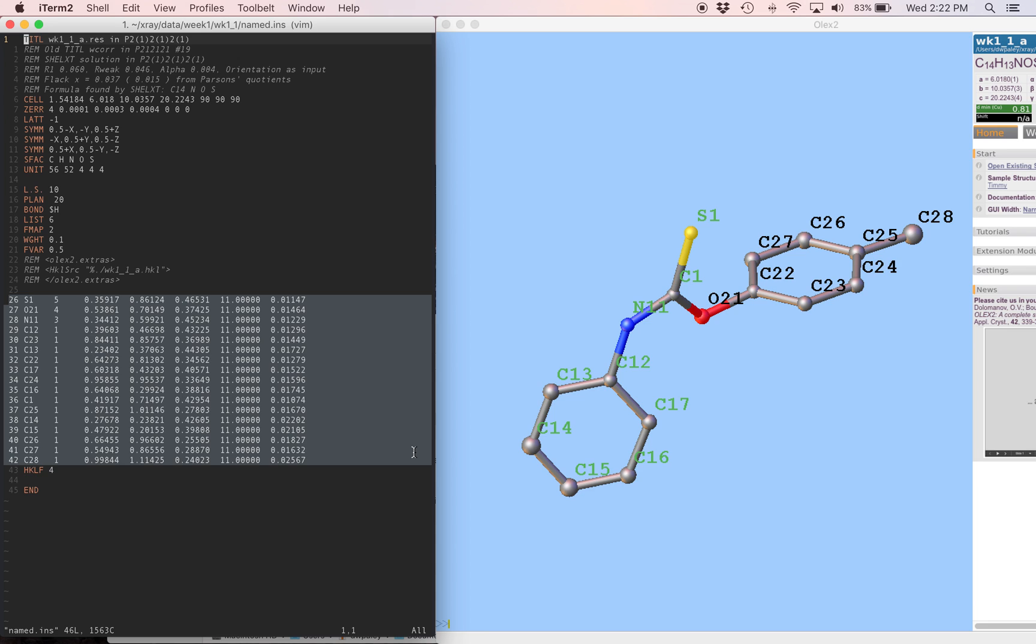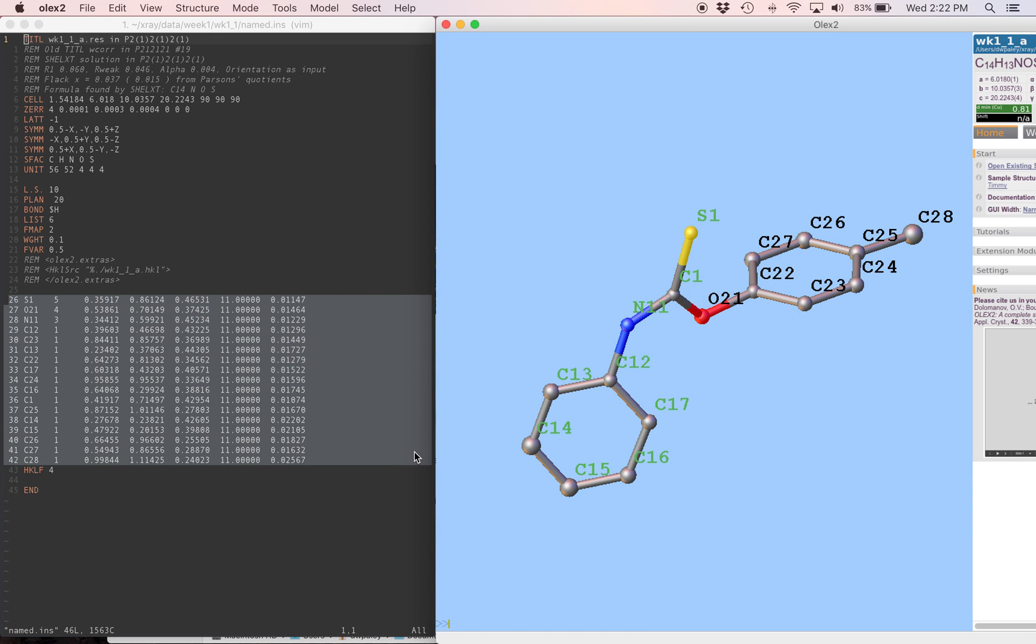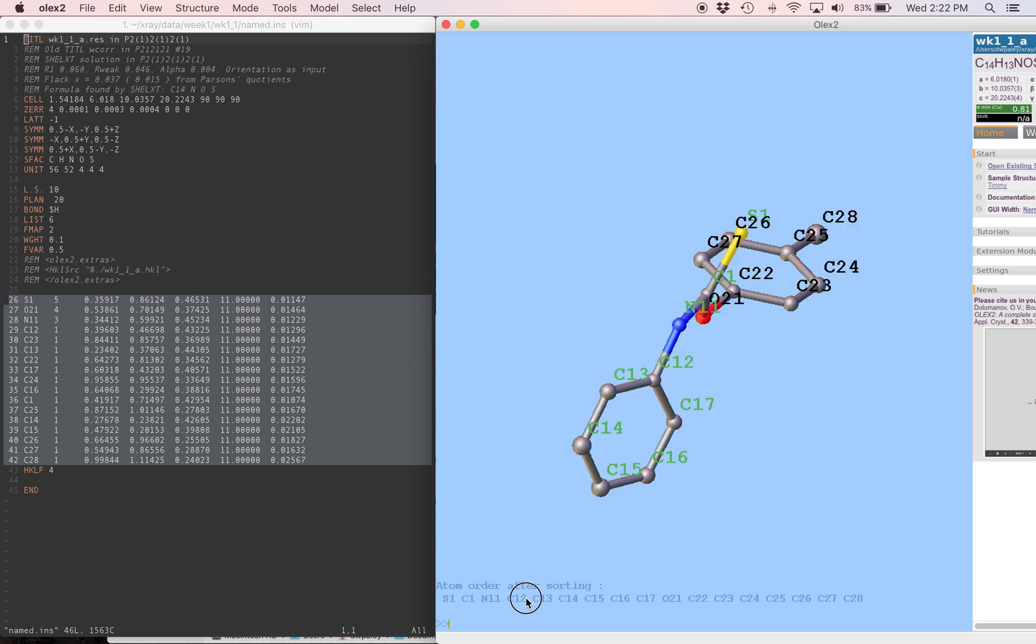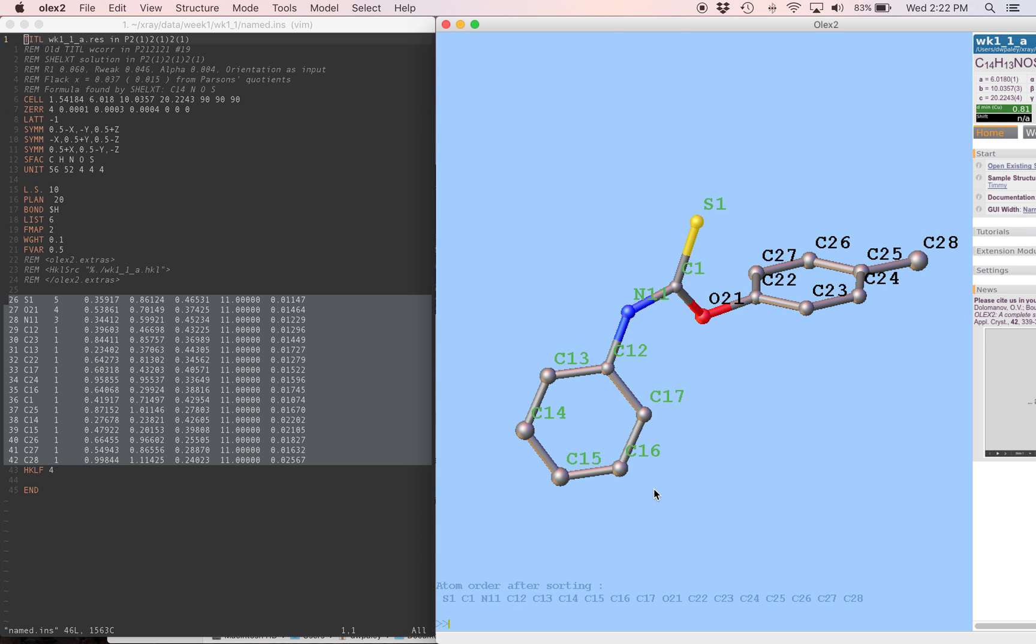So we want to fix that too, and it turns out that's pretty easy in Olex. I'm just going to type sort +n, enter. It gives me the order of the atoms after sorting. It's exactly what it sounds like. It goes in numerical order. And now we can output a new file. We're going to name it file sorted.ins.